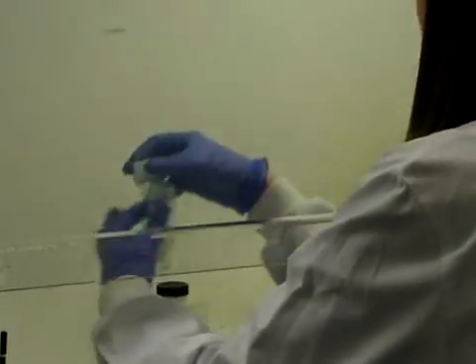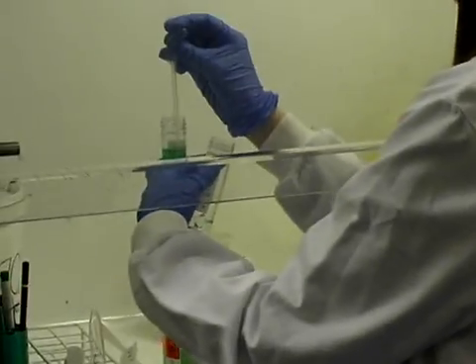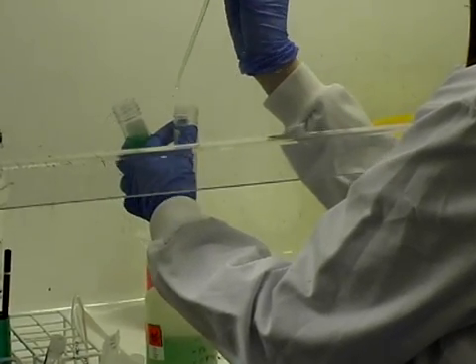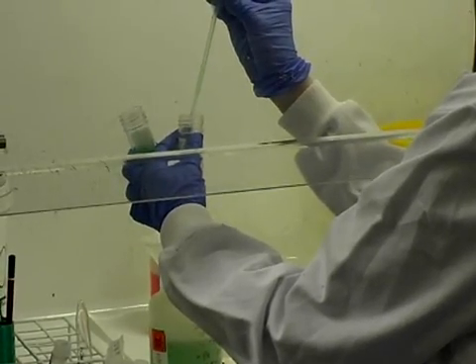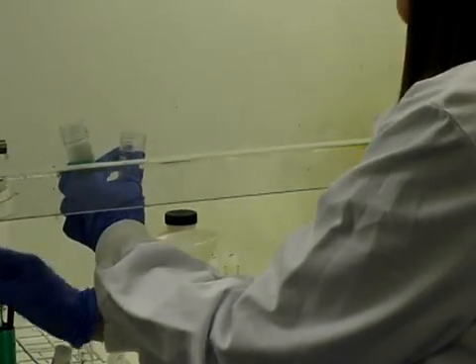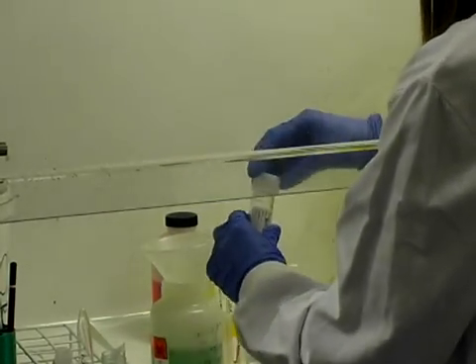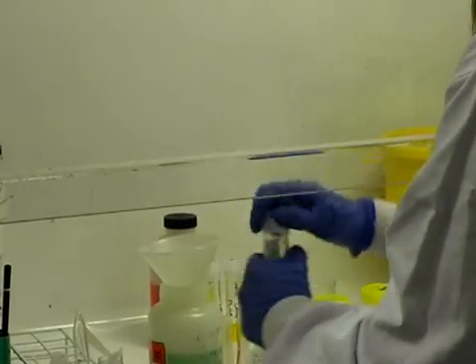We then add another preservative to it. We add five millilitres and then we give the bottle a shake to mix up the preservative and the cells.